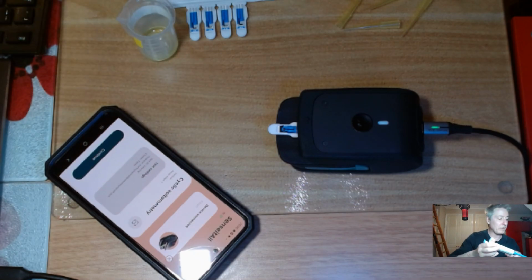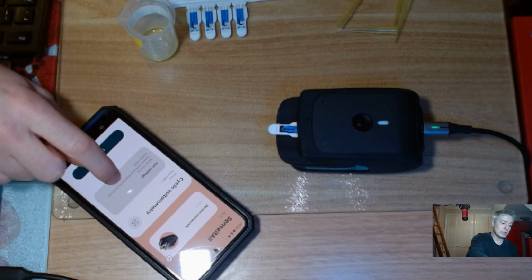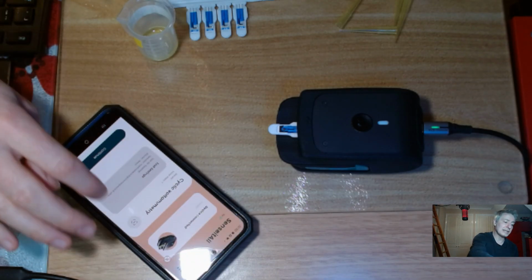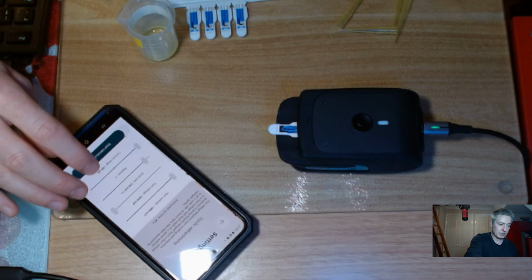It's not really talked about that much, but you'll always polish a glassy carbon electrode. You'll always polish gold electrodes. But you never hear anyone really talking about activating or polishing screen printed electrodes. Well, in my particular case this evening, I will polish it, or rather clean it. So I put some pH 2 sulfuric acid on there.